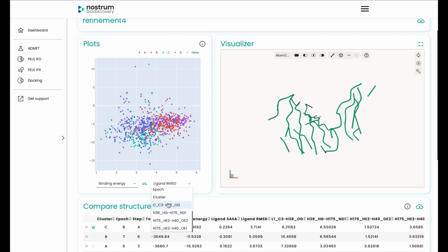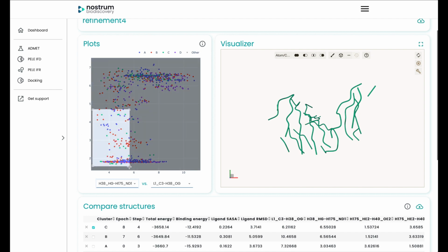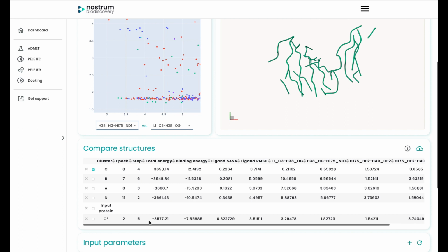We have them here. Catalytic activity is predicted in the original paper by measuring the amount of structures where distances required by the catalytic event are below 4.5 angstroms. We can see in the plot how there are a bunch of structures satisfying them. If we click one of these structures, we will incorporate that structure as a row in the table below.